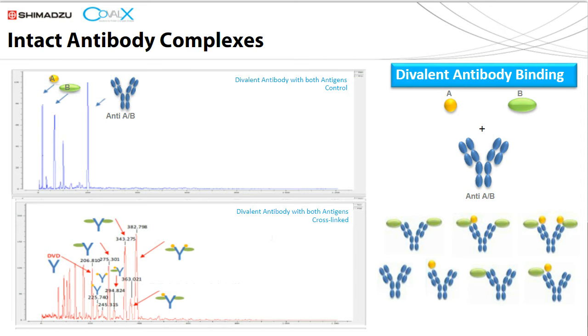And on the lower spectra in red, what we see is the primary peak at 383 kilodaltons. Again, with the high mass detection, a direct measurement, it's several hundred kilodaltons. And this corresponds to the 2-to-1 stoichiometry as the predominant peak, as was hoped to be formed from this sample. Additionally, we can see some of the less intense peaks from the 1-to-1 stoichiometries, and other 2-to-1 are present there, but the predominant peak is, as hoped, the 2-to-1 stoichiometry quite clearly.